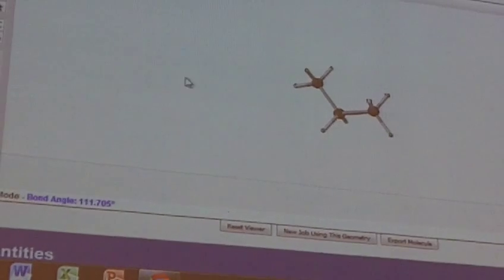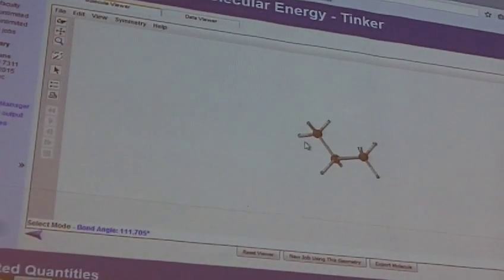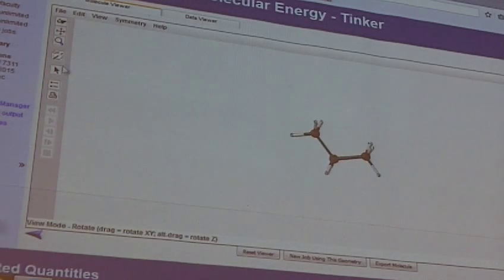For example, if we need to look at a dihedral angle, remember that involves 4 atoms. So say we want to look at the dihedral angle between one of the hydrogens on carbon 3 and then the other carbons. We select, it's really hard to see here, hang on, just make sure it is selected. Select our hydrogen here, and then hit shift.